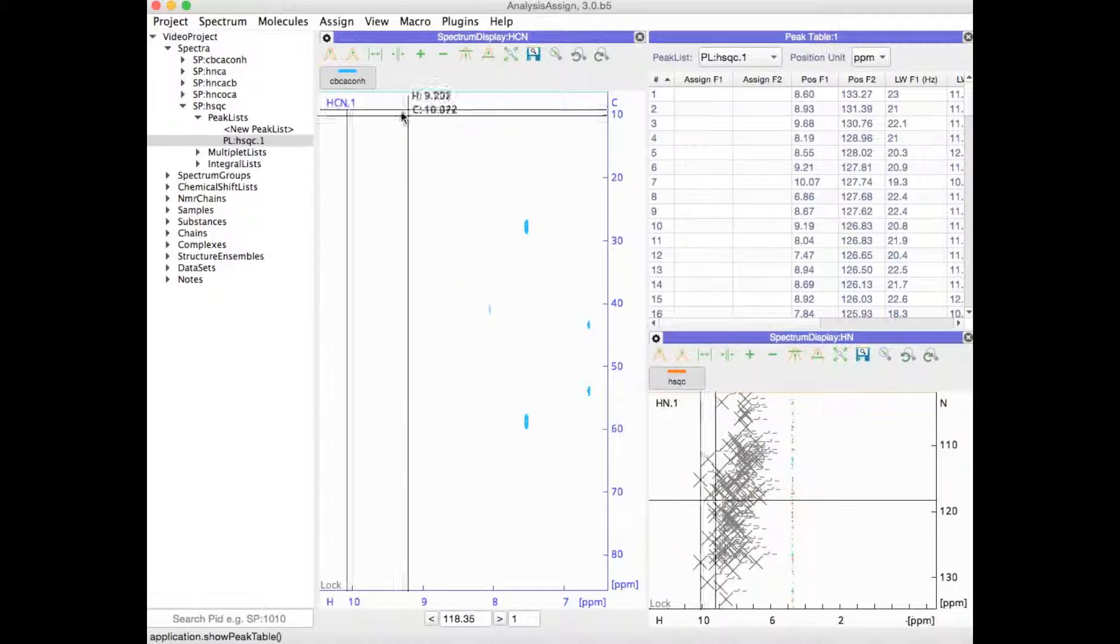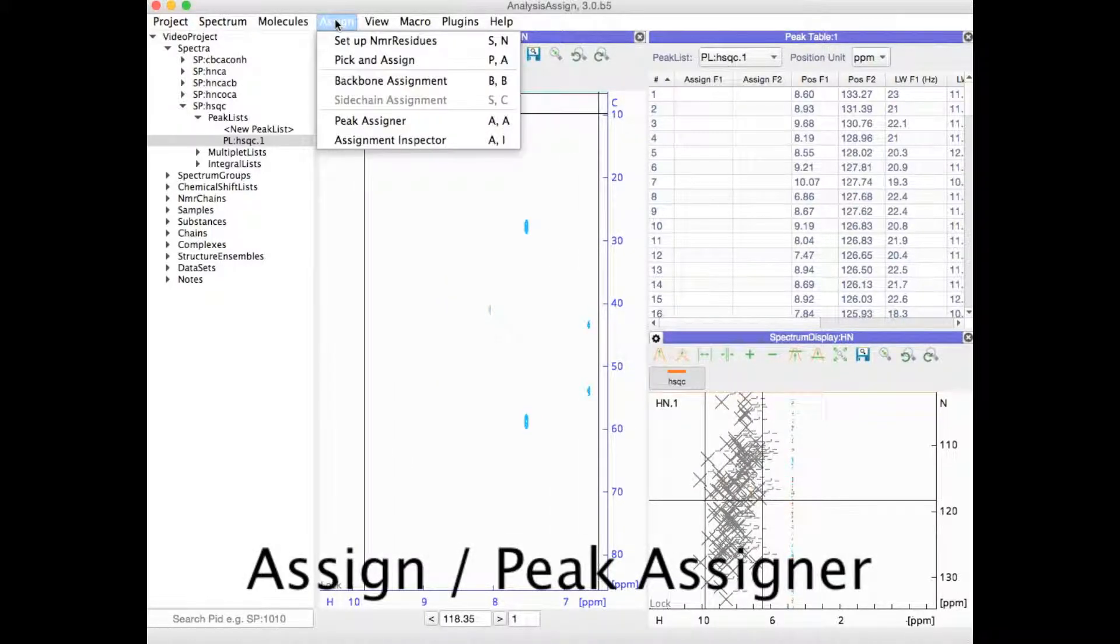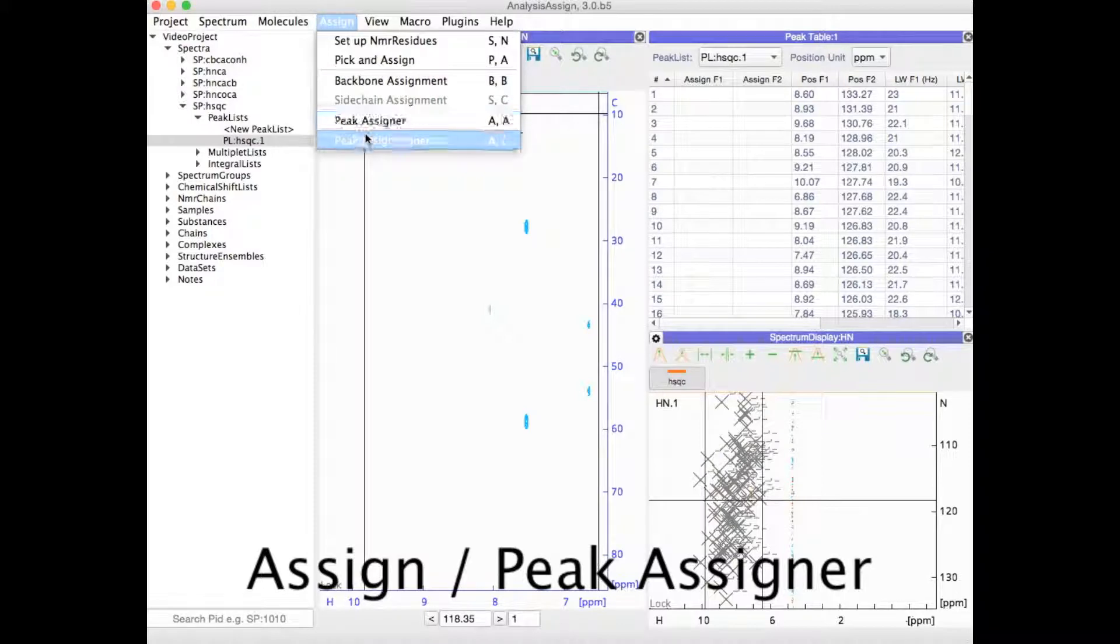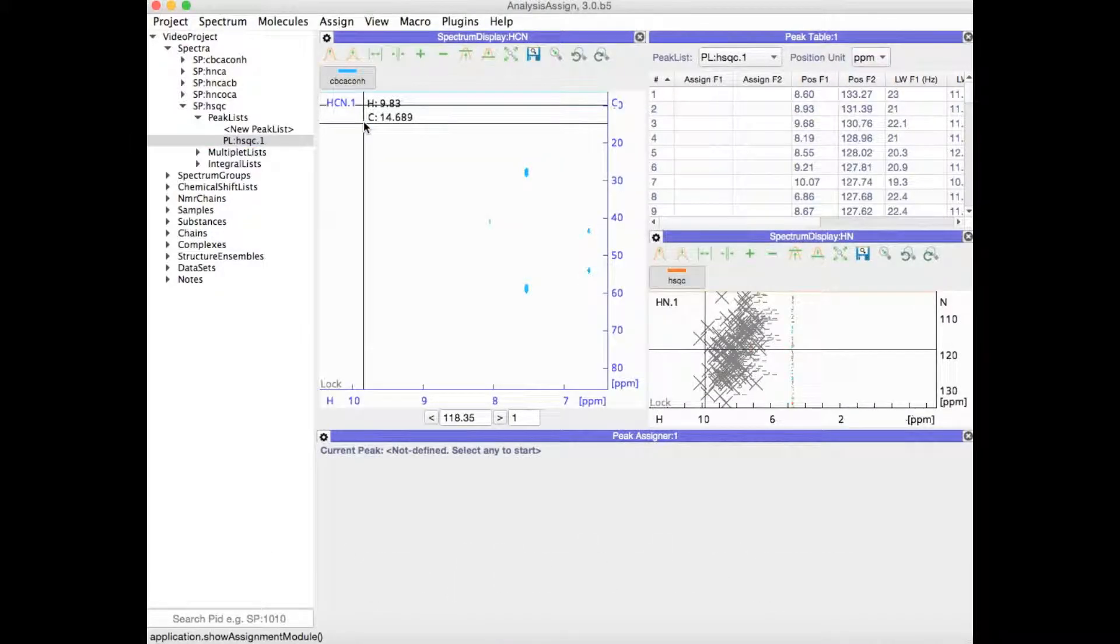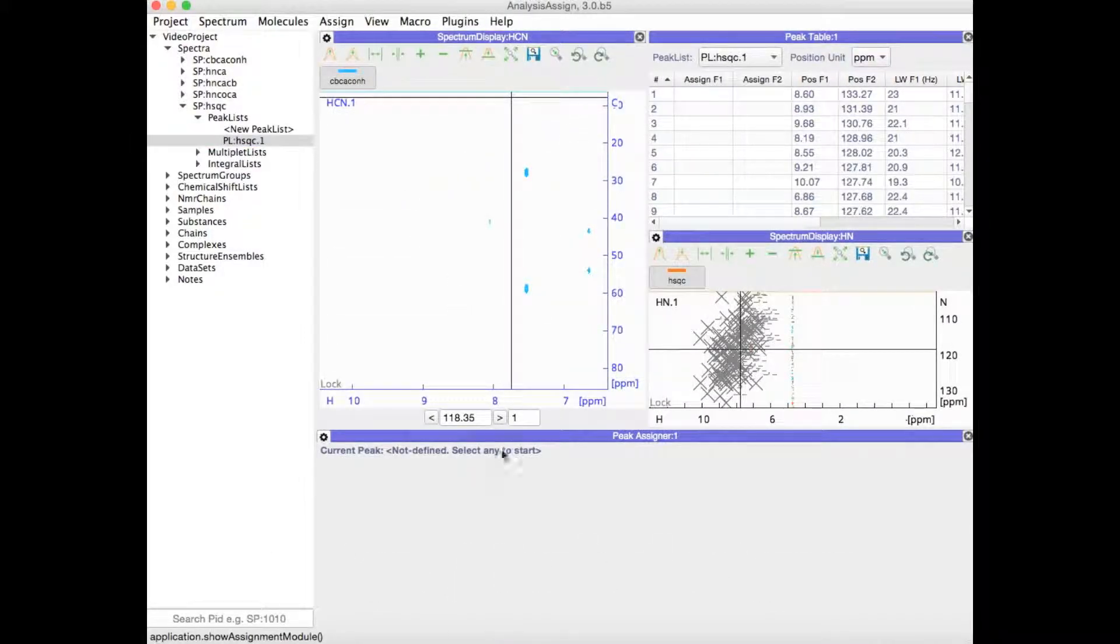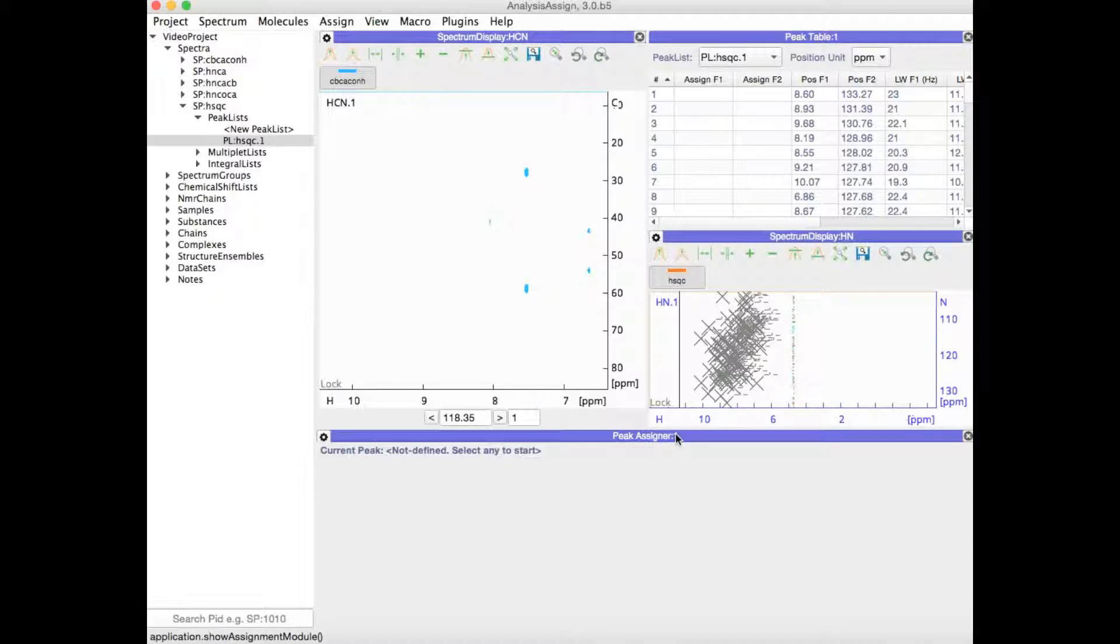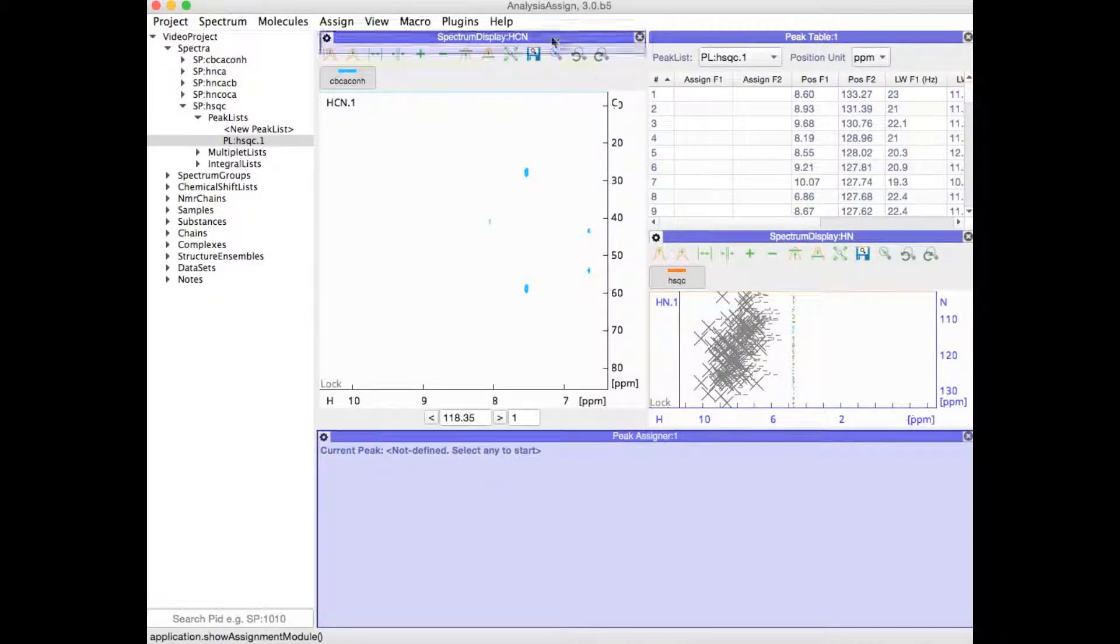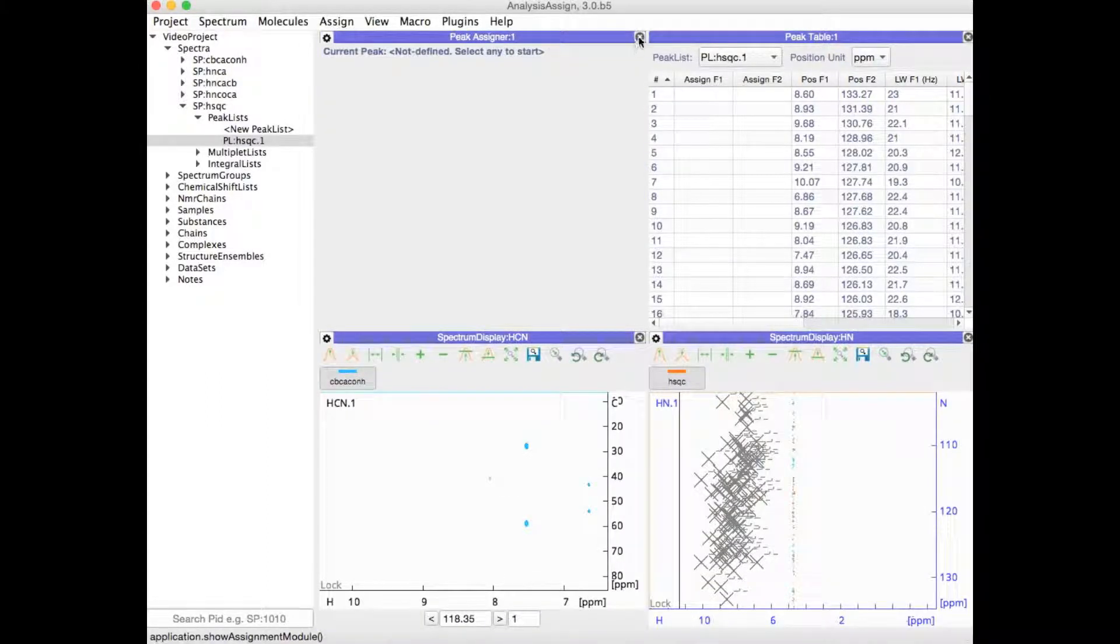Similarly, if you open a module from the menu, the computer will decide where it goes, and you can then drag it to another place of your choice.